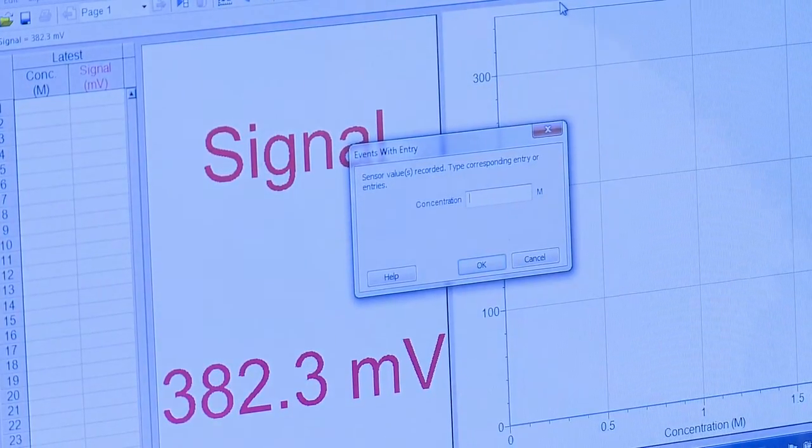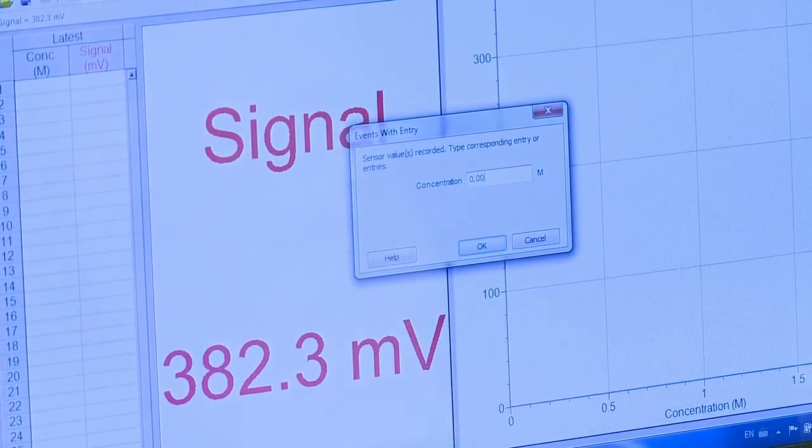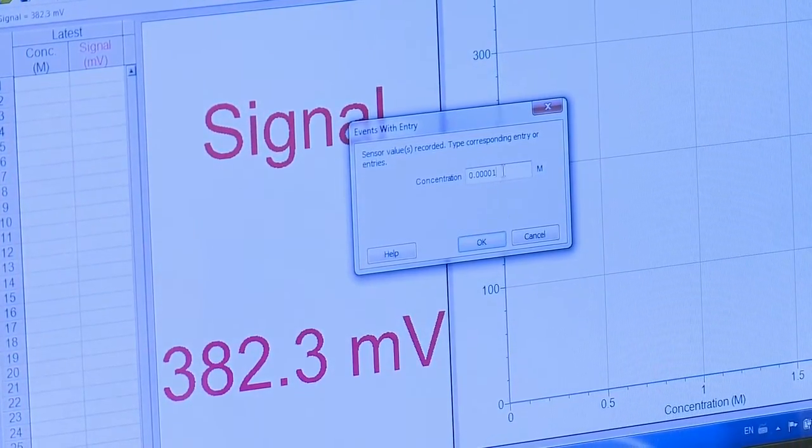A window will prompt you to enter the concentration of the solution you're measuring. And click OK.